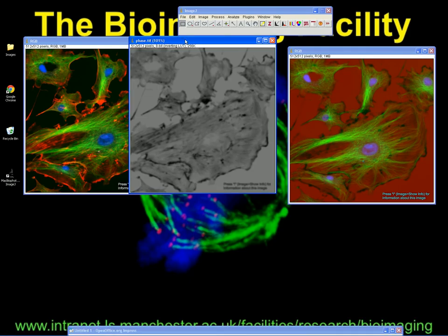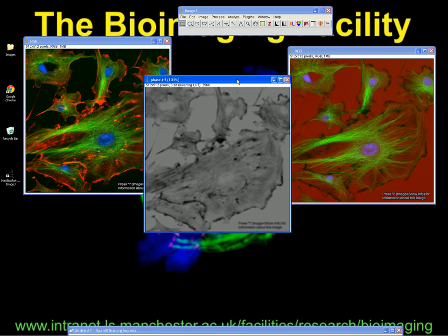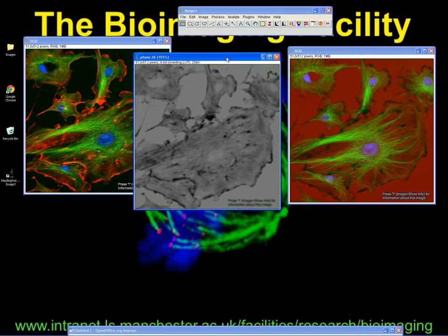I've had a question about how to make a montage when you've got fluorescent channels and the phase contrast image as well. So I'm going to show you two of the most common ways of storing the images and also how to process them to make the RGB merged montage.